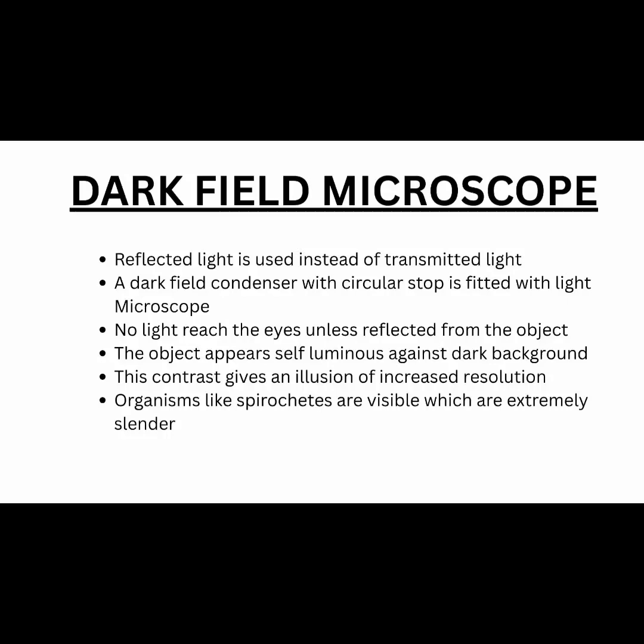Okay, and the contrast gives an illusion of increased resolution. So here also contrast is made. Organisms like spirochetes, which are extremely slender bacteria, are visualized using dark field microscopy.